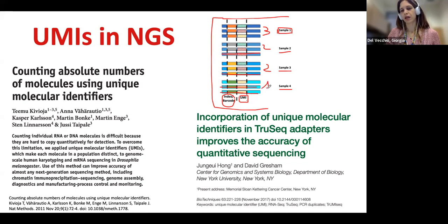So I only have 1 here. Without the UMI, I would say that all the 4 samples have 4 molecules here. I cannot say that there is any artifact. Thanks to the UMI, I can adjust my results to the real molecules, okay?